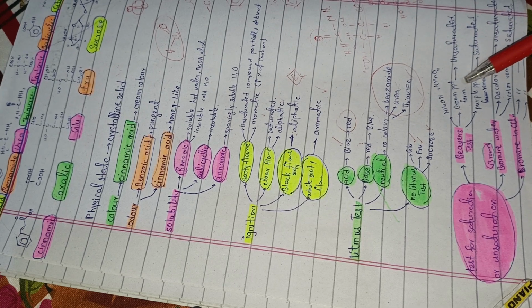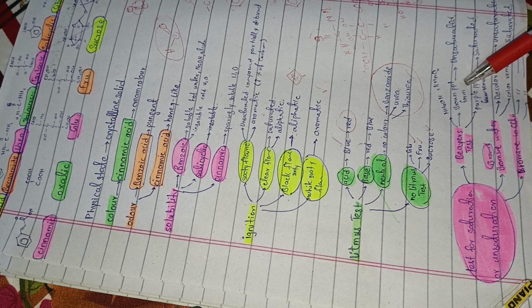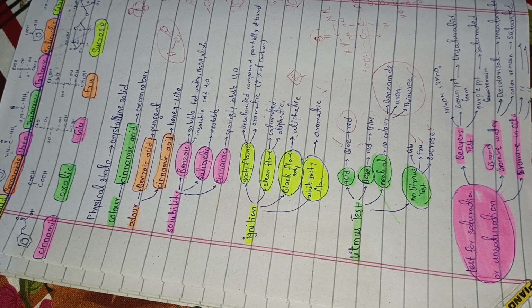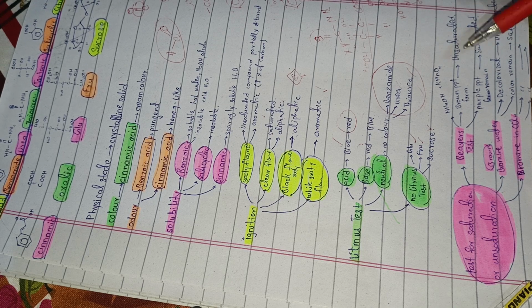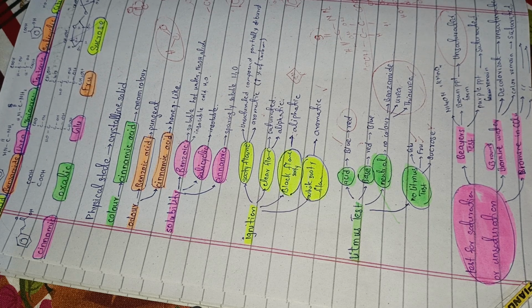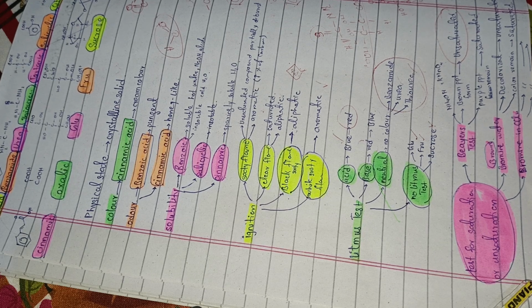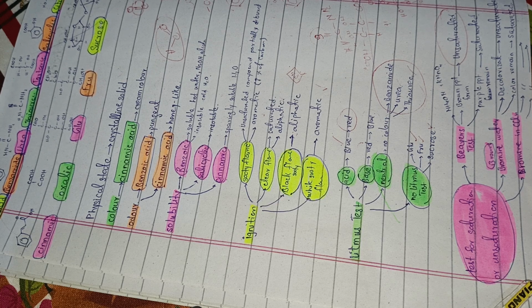After cooling it, you have to notice the precipitate appearance, and the color of the precipitate, whether it is brown or purple. If a brown precipitate appears, then you are in luck, because you will know that your compound is unsaturated. I have explained that all of these compounds here are unsaturated, so all of these compounds are going to give you a brown precipitate.